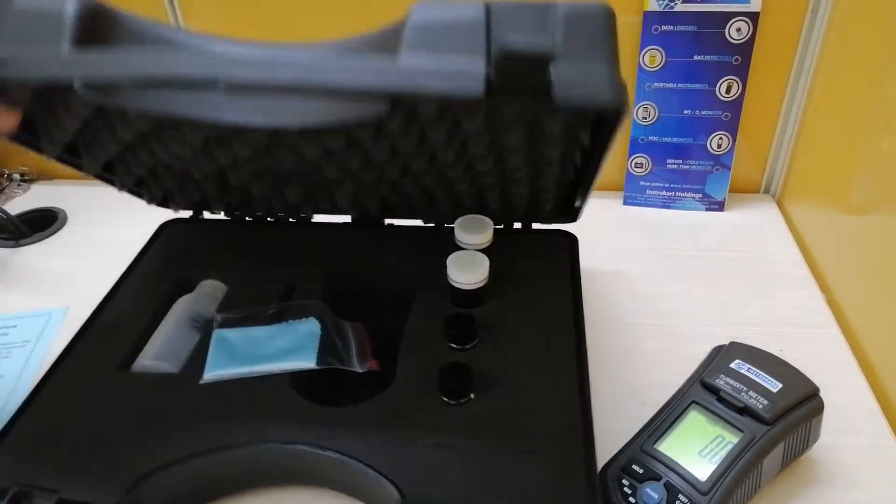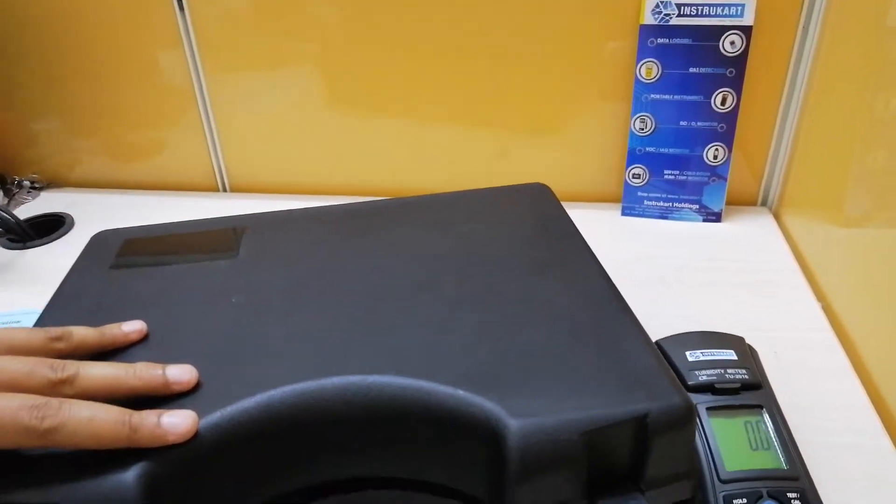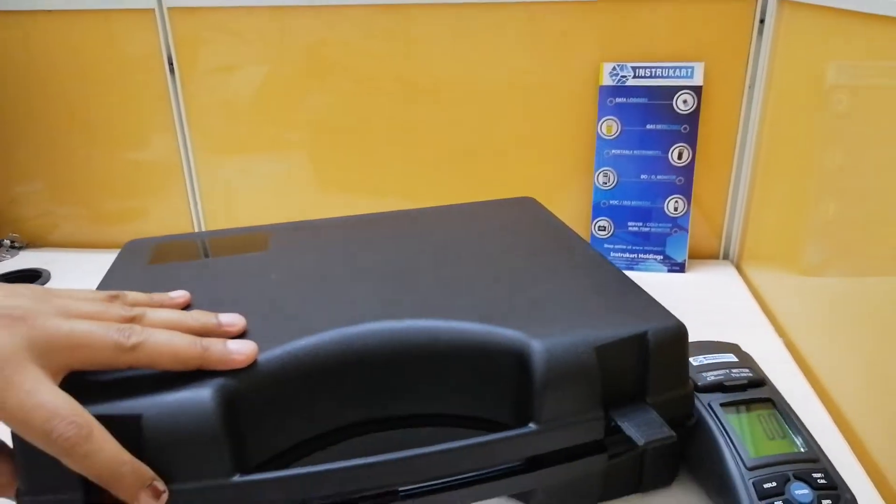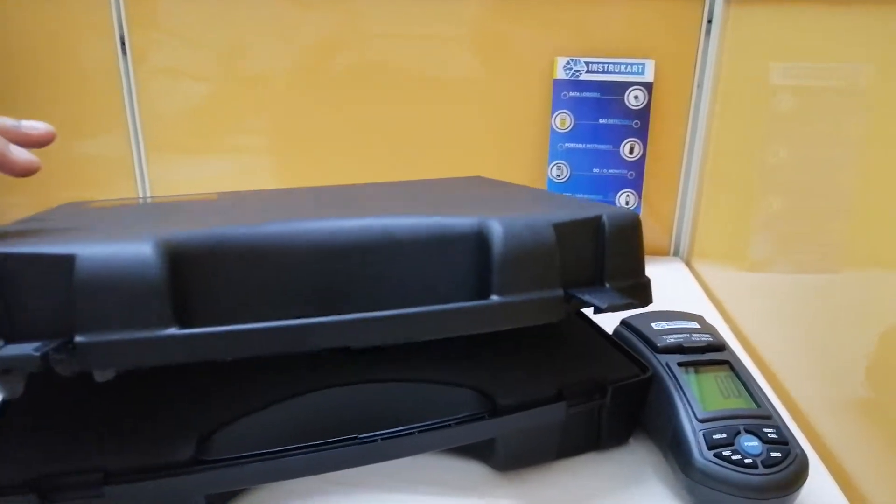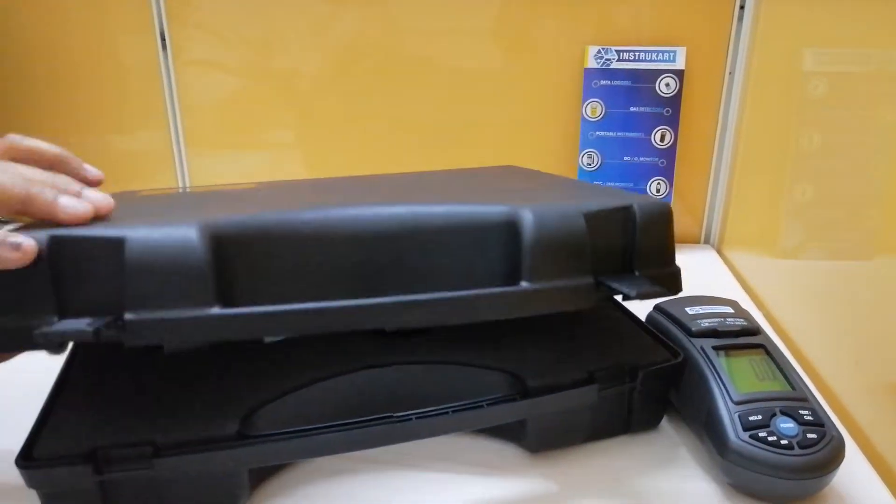Apart from this you got a case where you can carry easily. So this particular case is very easy to carry and it has been built with a very hard material, so it's very robust also.